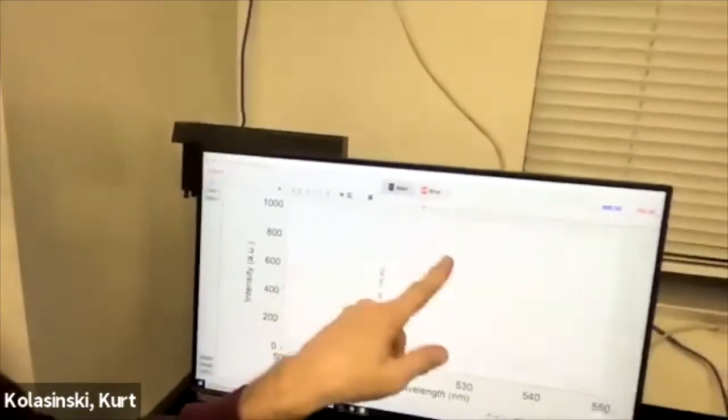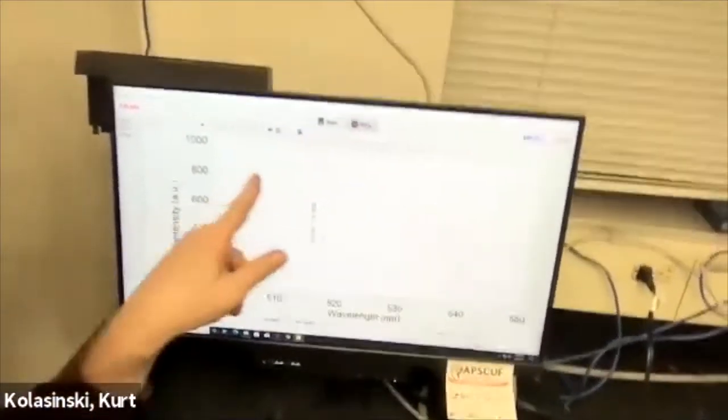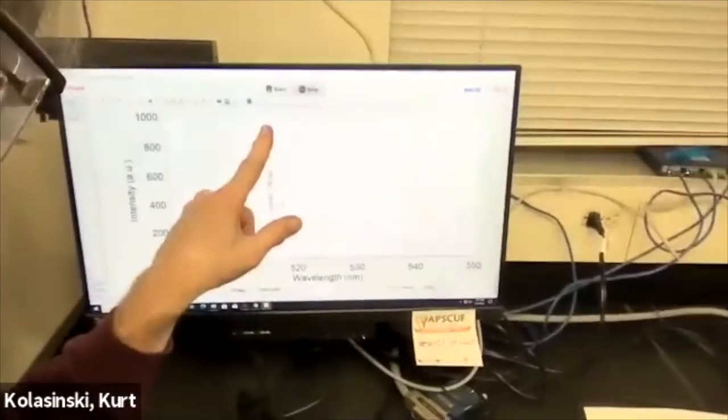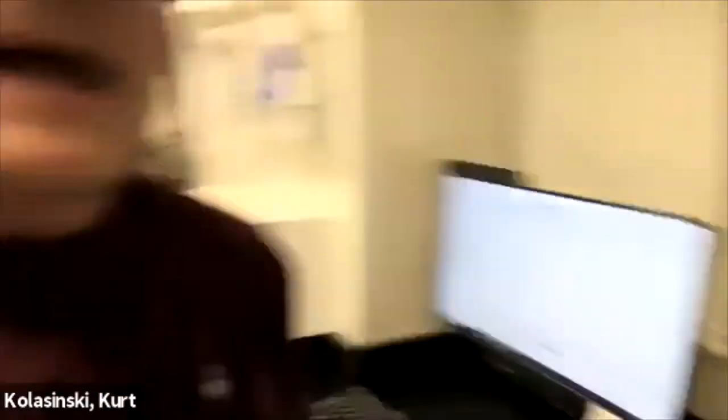Do that. Open. Oh, look at that, baby. Now there's signal. Yeah, baby. So now we're up here above 800. We've got maximum signal without being saturated. I think we're good to go. So what we need to do is write down what we have so far.